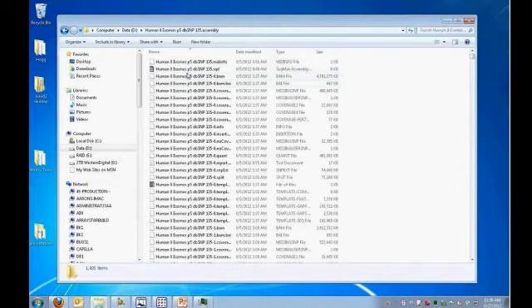So it's essentially a set of BAM files and accessories per reference sequence in my assembly. So this is chromosome 1. Here's the BAM file. It's 4.7 gigs. Of course, it's going to be the biggest. And then there's also a BAM index file. The format of these files, the index file and the BAM file, follow the SAMtools specifications.